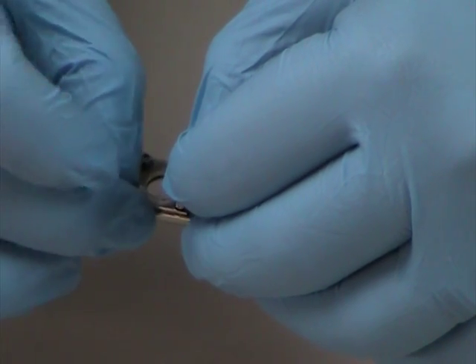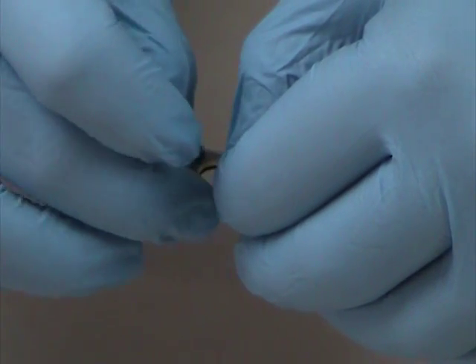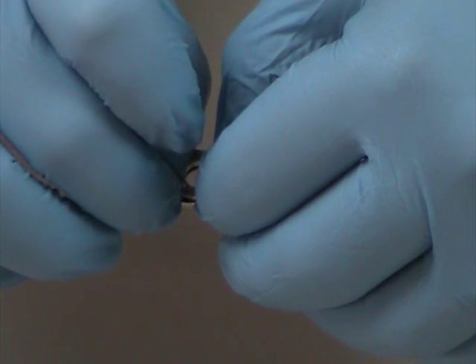Now I'm twisting the wave washer so that the edge of the washer is placed right on the top of the sample holder.